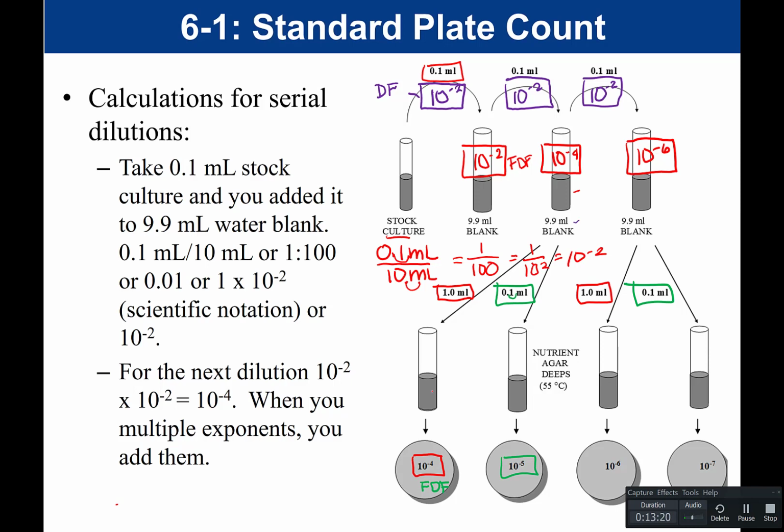So when we're doing this experiment, these plates are actually empty when we start, meaning they don't have any agar in them. What we do is we take the agar that would normally be poured in a plate and we mix the bacteria with it and then pour it on the plate and let it solidify into a plate.